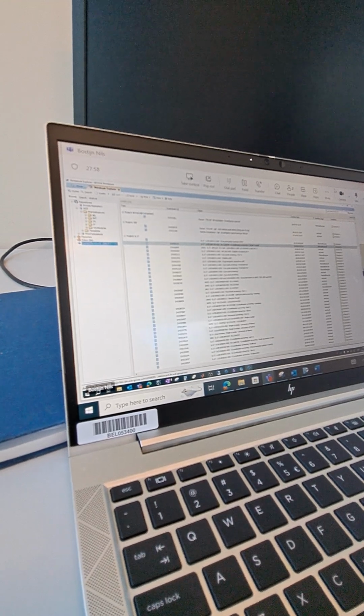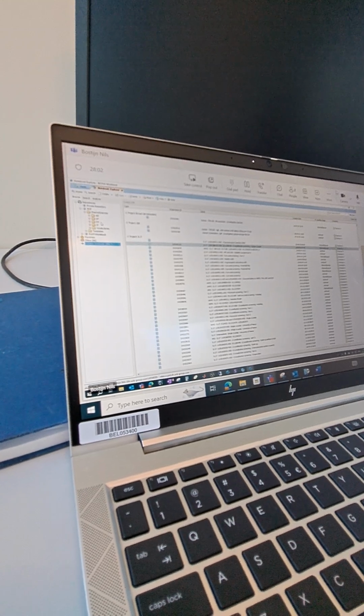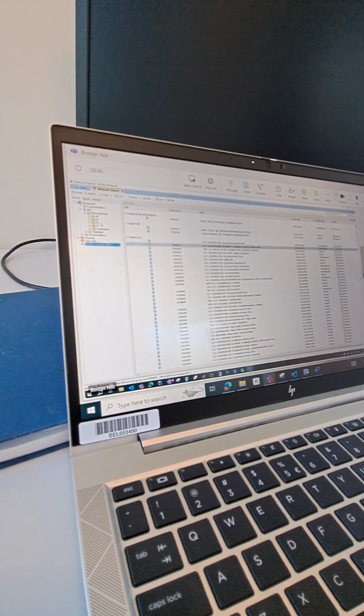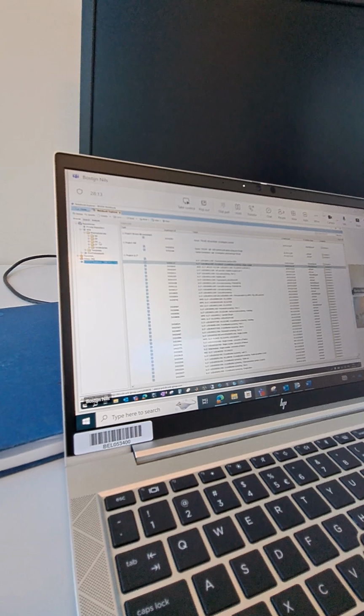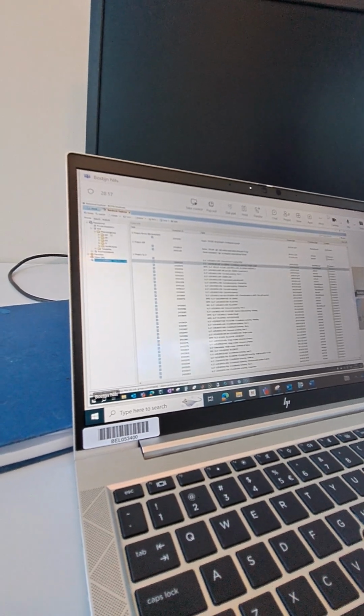The AD, DP, and DS are in fact the three big departments we have. AD stands for analytical department, DP is drug product, DS is drug substance. The solid state group, we are part of the AD, analytical.